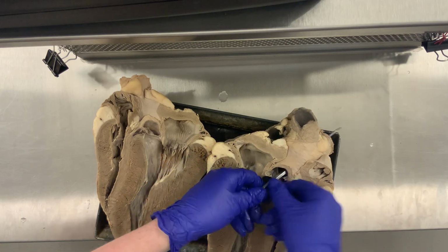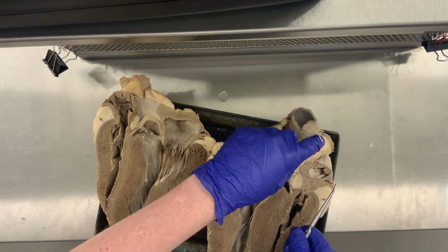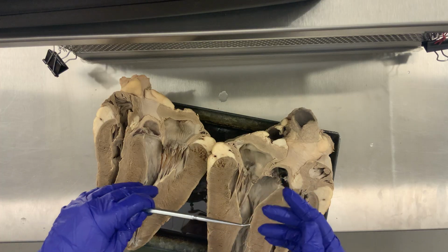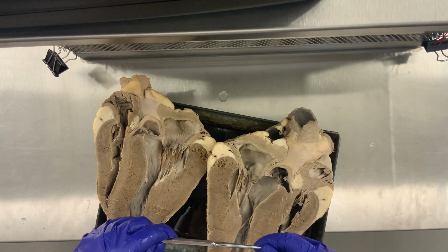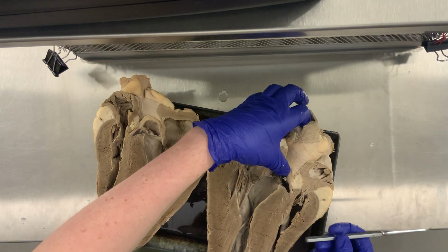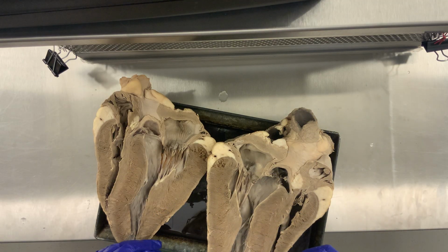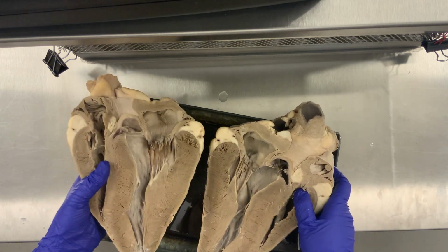And the aorta has several branches in this cow's heart. It can come out here and here. When the aorta turns into the aortic arch, remember, for this lab, you just need to remember the first branching vessel out of it is called the brachiocephalic, and that will bring blood up to the right upper limb and the head, because brachio means arm and cephalo means head. Then the blood that doesn't go through the 3 branches on the aortic arch is going to come down and travel through the descending aorta to bring blood to the legs and lower body. So that's everything that is on the inside of the heart.